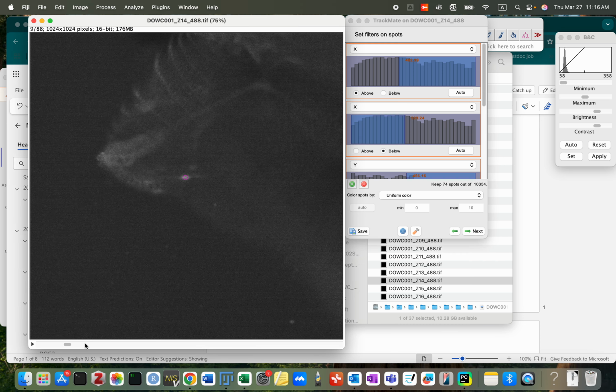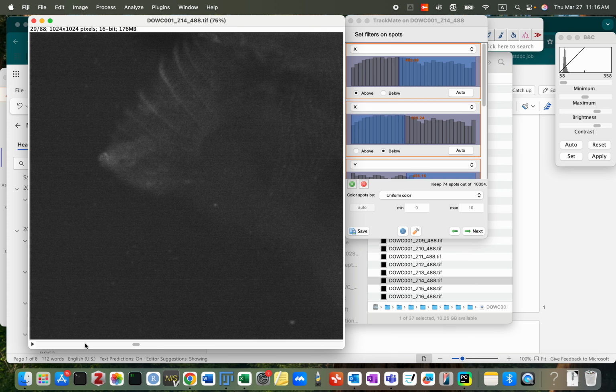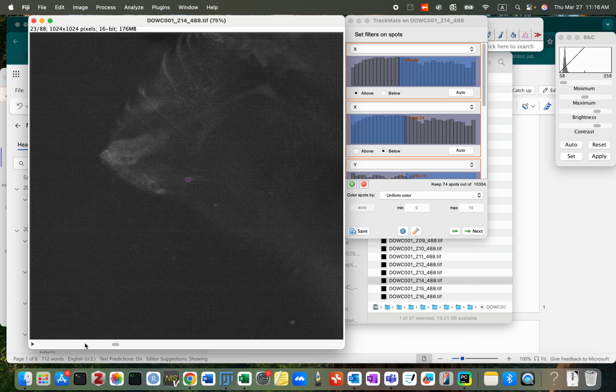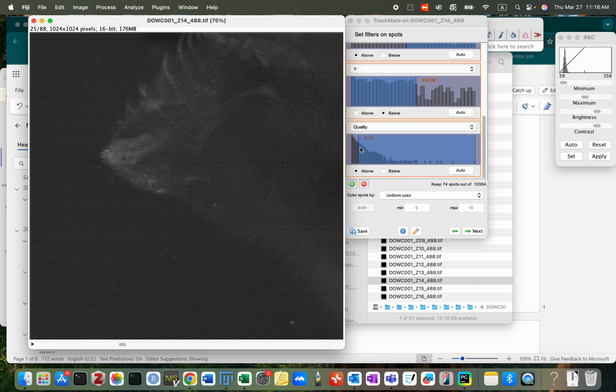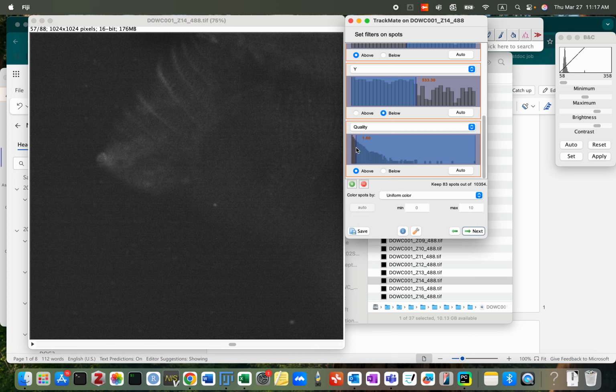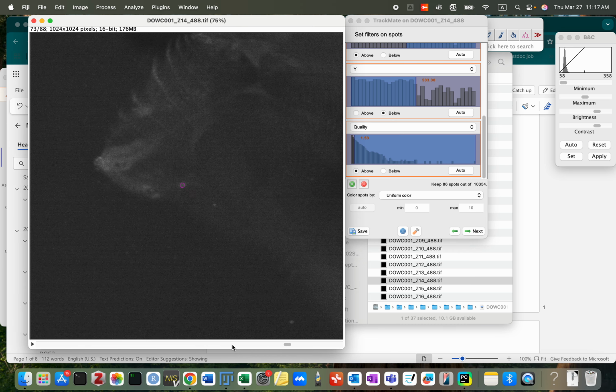We check, are all the time points selected? For this data, because for some time points the fluorescence is quite weak. Let's see. Okay. You need to adjust the quality filter, okay? But for this condition, it is okay if nothing shows up because you barely can see it with your eyes, okay? And you are sure from other stacks we have much stronger signal. Yeah.